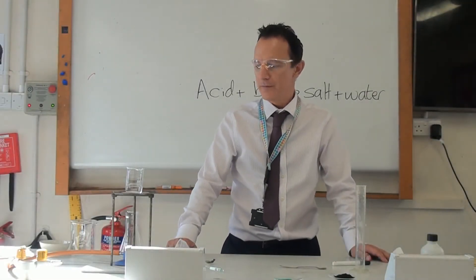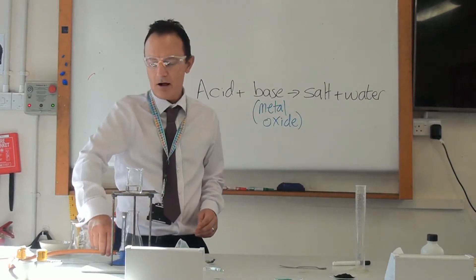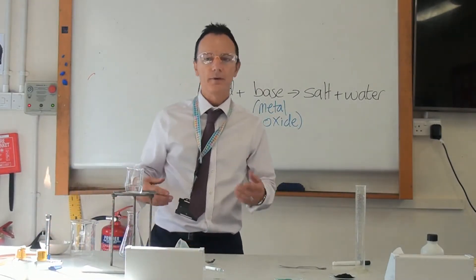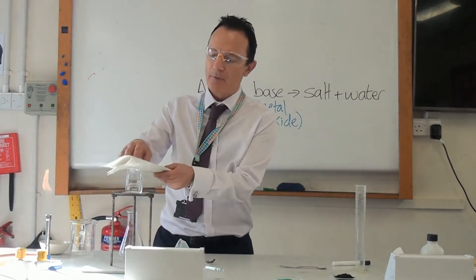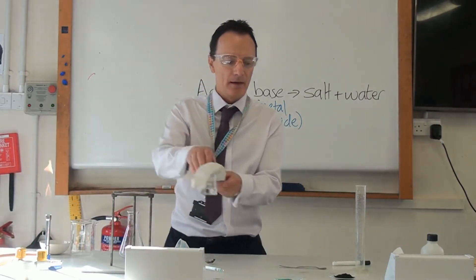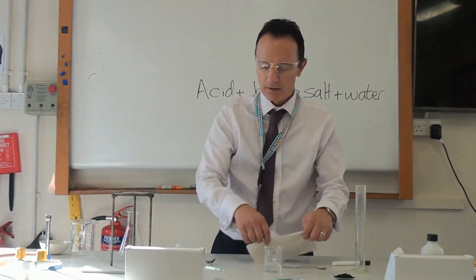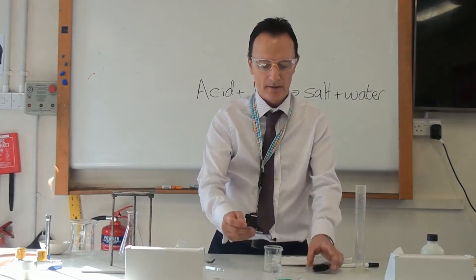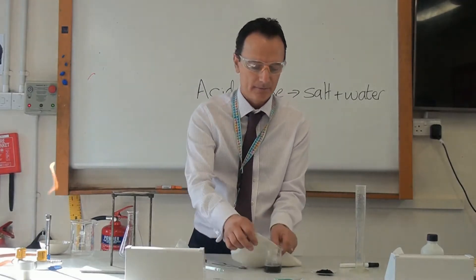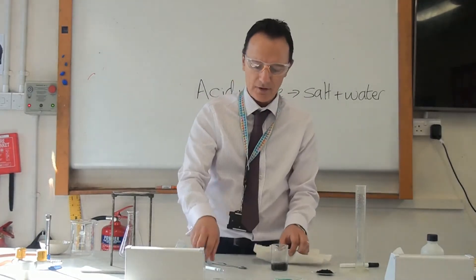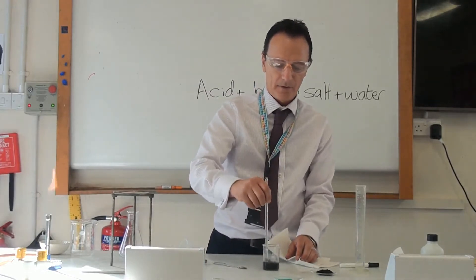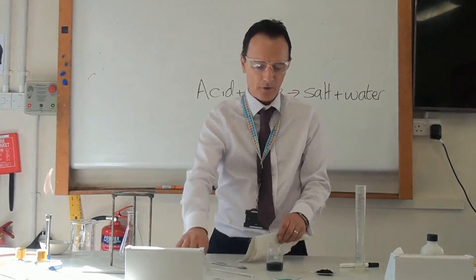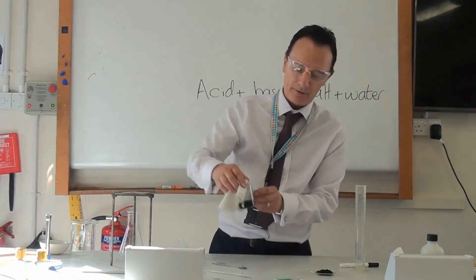The acid has been warming up for a few minutes now. I am going to take it off the heat so it does not start to boil — we only want it warm to increase the rate of reaction. Then we are going to start adding the copper oxide. I will add a small amount of copper oxide to the acid and stir.